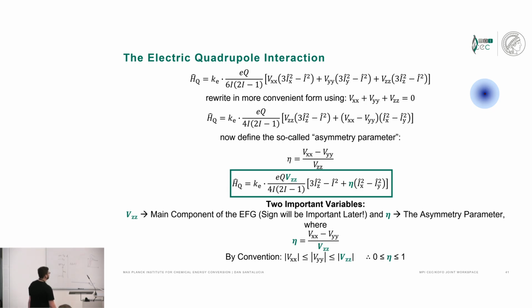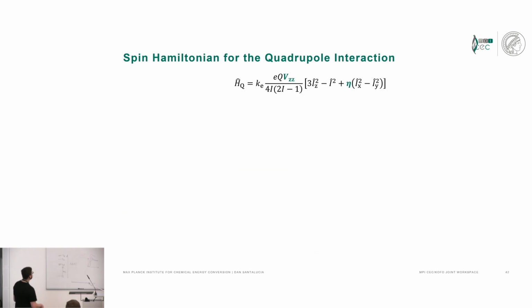This is going to really be the main determiner of how big it is. Yep, I already told you about that. The only thing is, unlike EPR where it's defined from 0 to 1/3, in Mössbauer we define it over the range of 0 to 1, but otherwise it's a very similar concept.